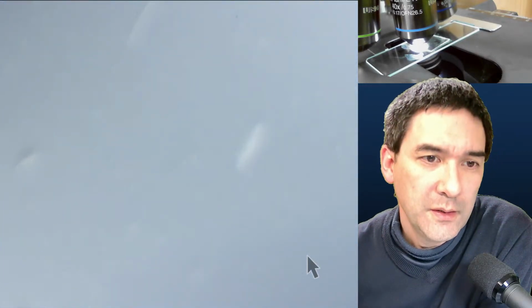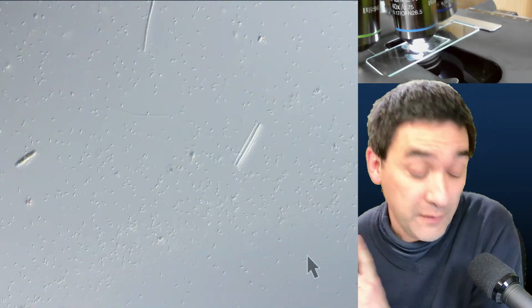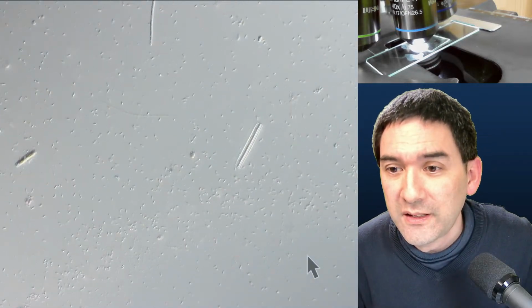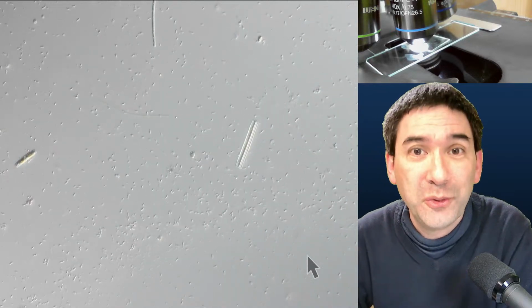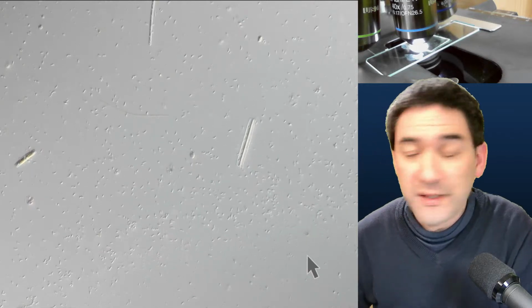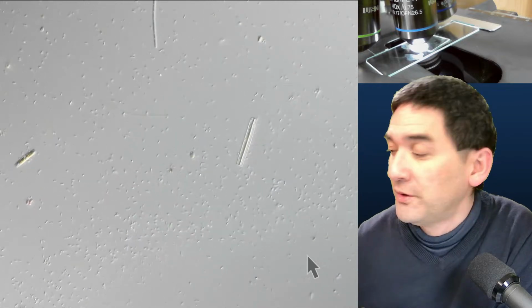Okay, so now let's have a look how this actually looks. I have to admit I have not tried this yet with dark field with the microscope here, but let's try this, okay? That's a lot of bacteria. Do you think that the sample is decomposing? Of course. That's what bacteria do, at least many of them. So this is following the oxygen. That's amazing to know. Yes, that's a very common observation.